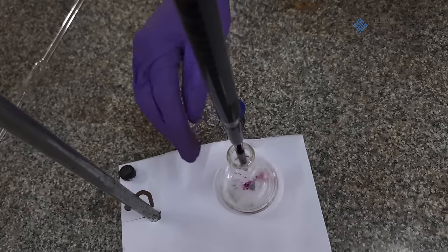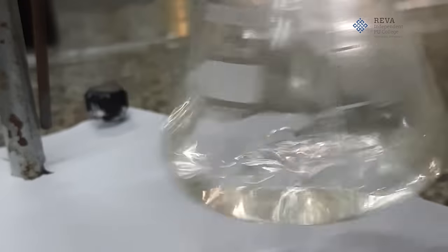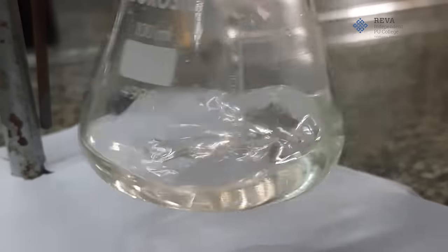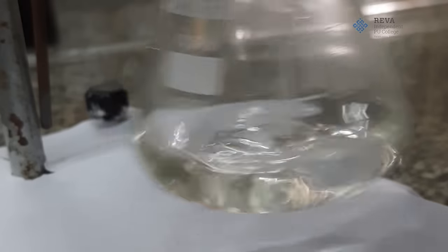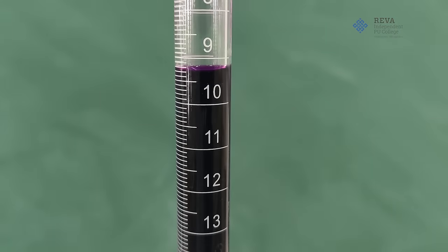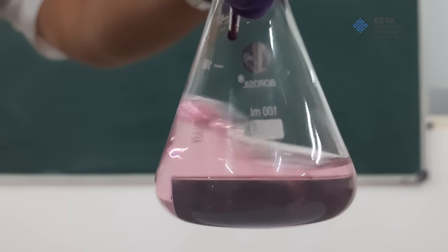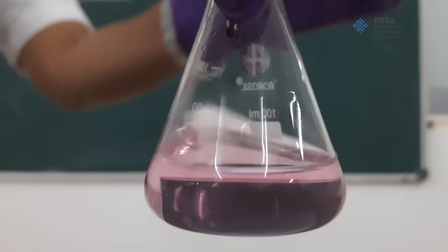We can observe the pink color in the conical flask vanishing fast. That means ferrous ammonium sulfate is reacting with potassium permanganate. Continue adding potassium permanganate solution till we get a permanent pale pink color as it is reaching an end point.